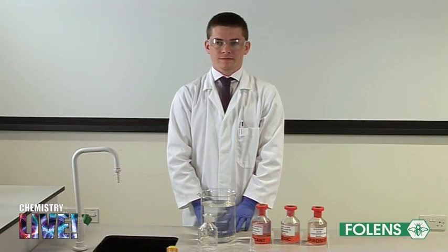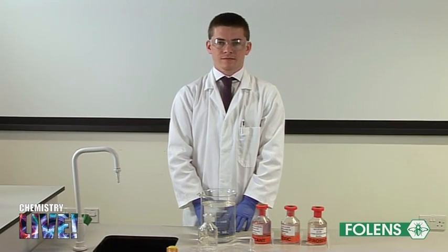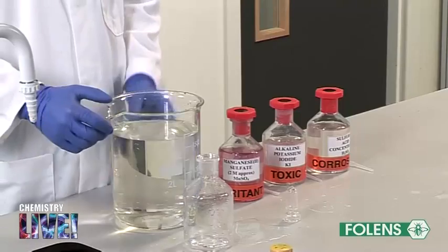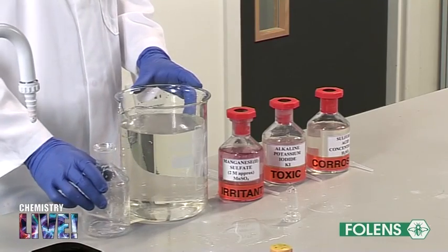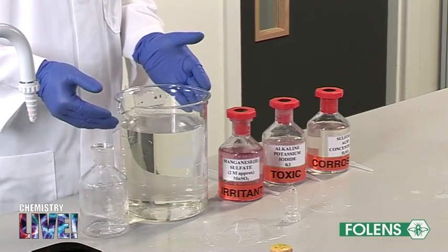Experiment to measure the amount of dissolved oxygen in a sample of water by means of redox titration. In this experiment we will measure the amount of dissolved oxygen in a sample of water using a method known as the Winkler method.